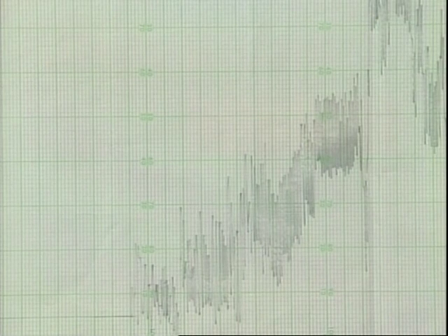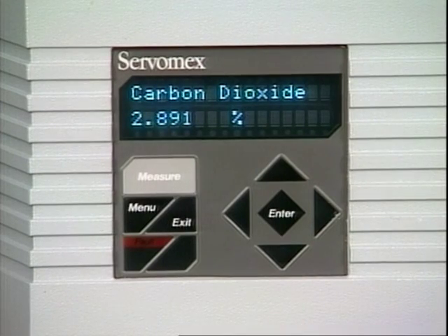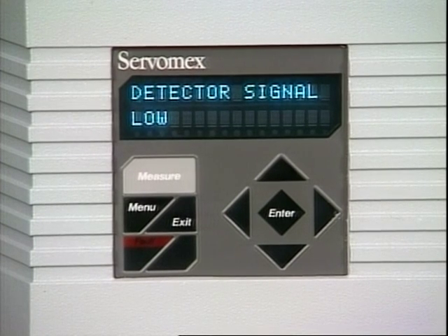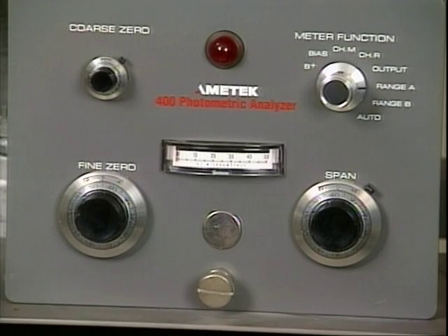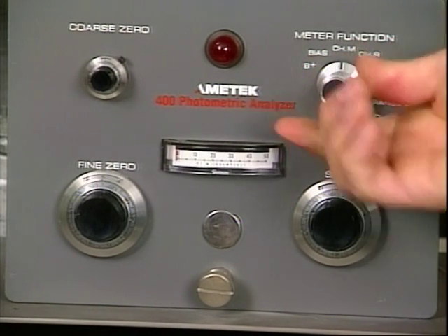Analyzer source problems may become evident in a variety of ways. A faulty source may cause baseline drift or erratic output, or the analyzer may not differentiate or respond to the sample component of interest. A source problem is suspected for this split beam analyzer. First, check that the lamp is operating properly. Ensure that the analyzer power is on, and check the output. Check the reference and measure channels.